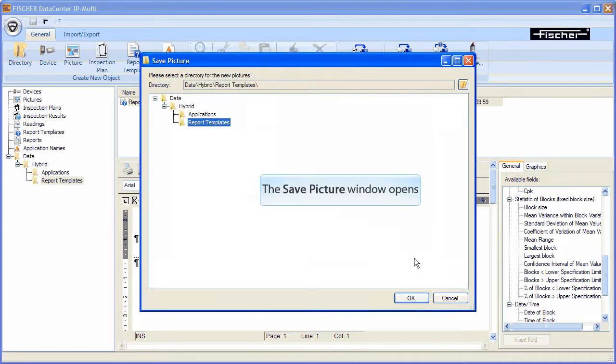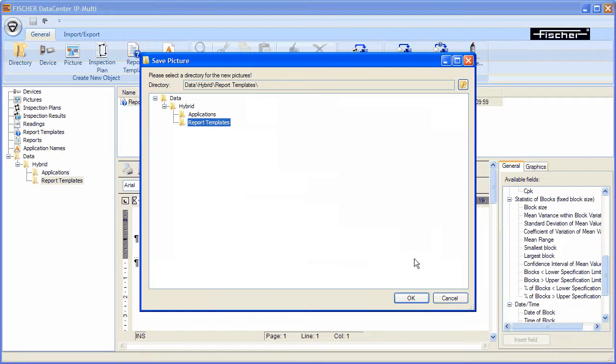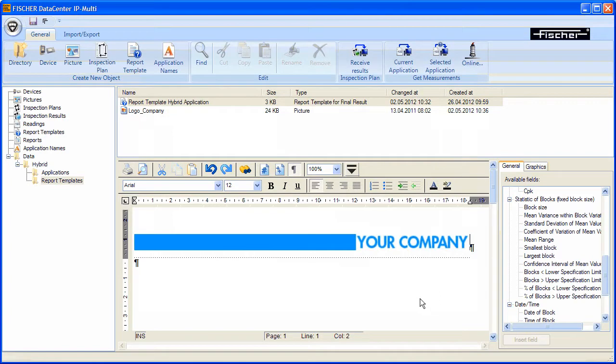The memory location for the logo is displayed in the new window save picture. After selecting the memory location, click the OK button. The company logo has now been added to the header.